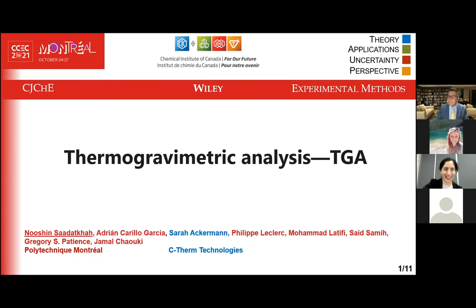Today I'm going to talk about thermogravimetric analysis. It's a really easy and cheap method. Probably many of you have used it before, many times. It's a technique to monitor mass change of a sample while heating it up in a furnace. But there are some details about TGA that, if you don't know them, you might end up making big mistakes in analyzing your sample.